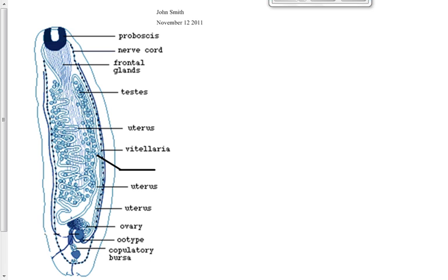Big thing: if you're taking art, they always tell you about shading, because that's how you give texture and dimension to drawings, as I understand it. You don't shade on a lab drawing. The reason is, if I decide this part's darker than the others and I just shade it, what have I done? Yeah, I've obliterated something on my lab drawing.